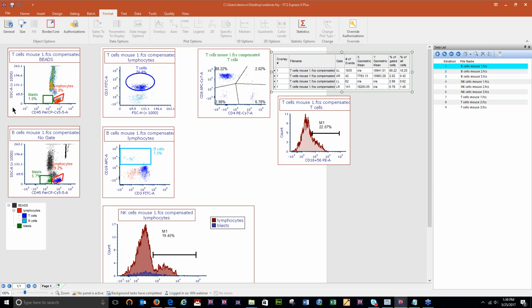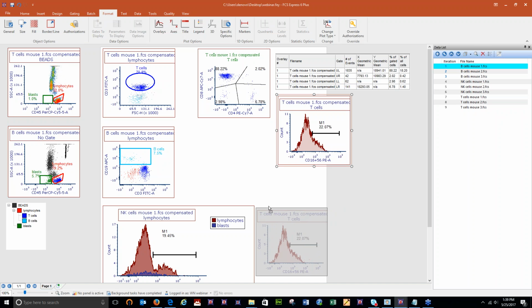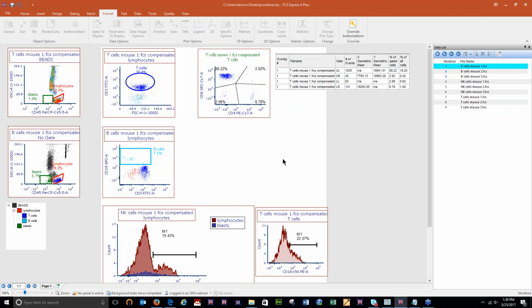Okay, so for instance, let's say we want to get a CD4-CD8 ratio. How would we do that? Right now you might be only doing that in Excel or even with a handheld calculator and jotting it down somewhere or typing it into your report manually. But in FCS Express you can easily do that very, very nicely using spreadsheets. Those are just like what they sound like. They're sort of like a mini Excel spreadsheet. You can think of them that way, a little mini Excel spreadsheet that resides inside of FCS Express.